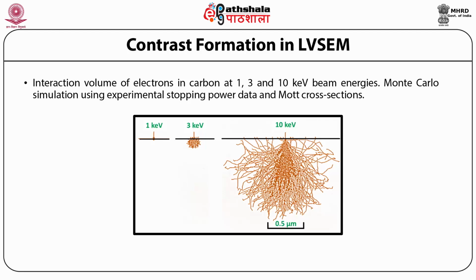be appropriate. It is also evident that the surface contamination marks, scratches, and dust particles, which are barely visible at 10 kiloelectron volt, became dominant for contrast formation in the 1 kiloelectron volt image due to a significant change in the form of the image contrast associated with a subsequent rise in the secondary electron yield due to the fall in the electron range.